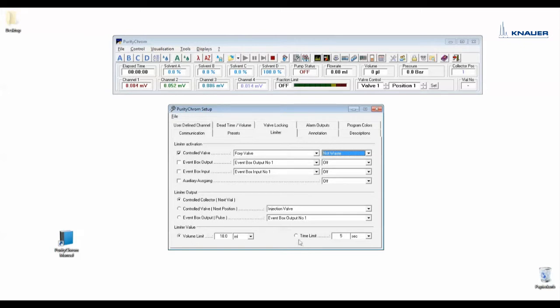If you fractionate with a fraction valve you would enter the fraction valve here and here in controlled valves. I wouldn't recommend to use a time limit because if you program your method based on volume or column volume it would be very difficult to calculate this volume.